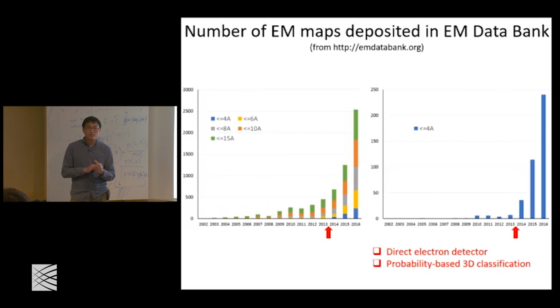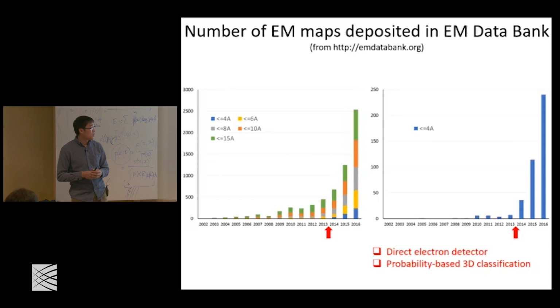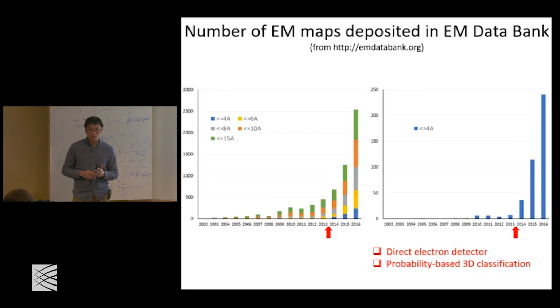In fact, it's the opposite: many people are super excited to see a lipid density after they solve the structure. I think your question is whether your specimen for your protein was actually embedded in lipid. No. So TRPV1 is in amphipol. It's some type of detergent, but it binds very tightly. But it couldn't be seen because it's disorganized. Yes, when you filter to low resolution, you can kind of see the weak density surrounding it.